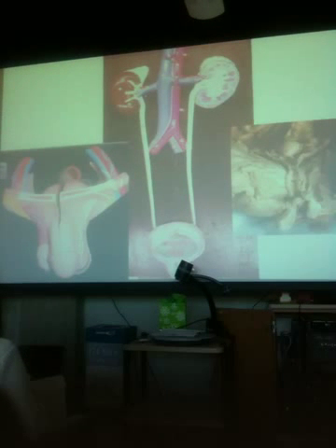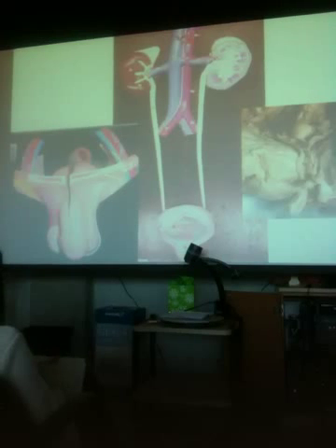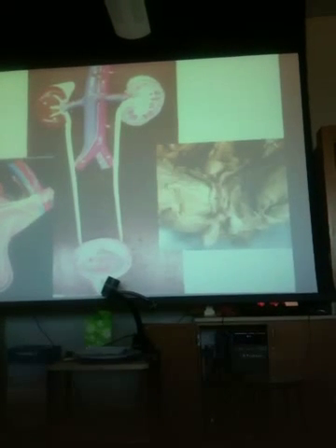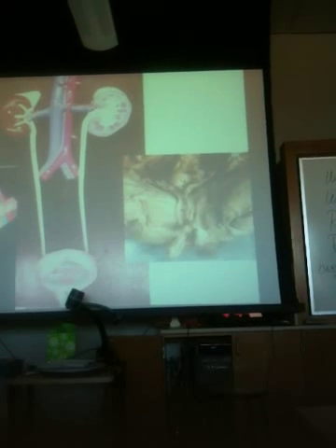And then there is an organ around the urethra. What is this thing right there? Prostate, so obviously this is a male that you're looking at. Here's a view of a mink, male or female? Male. What's that right there? Bladder.